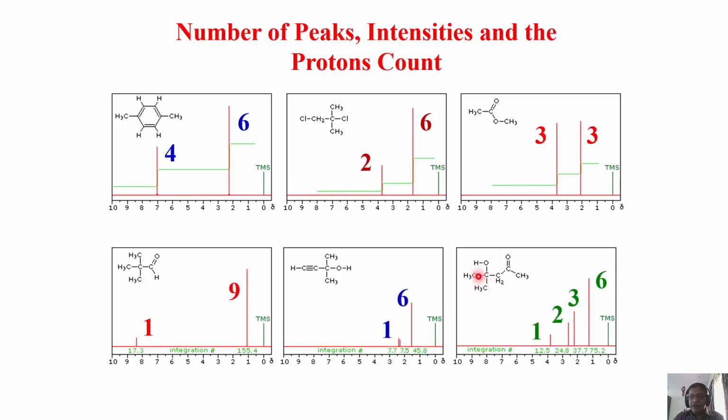Okay. In this molecule, it so happens this CH3, maybe the structure that is written is like that. These two CH3s are equivalent. Sorry, I did not know the structure. So there are 4 peaks here. OH is also here. OH is 1 peak. It is a theoretical stick plot. So this is OH. I mean, theoretically it is right. Although there is no symmetry, it is made to be equal. There are 2 CH3s overlapped here, intensity 6. Then 1 CH3 here, intensity 3. This is CH2, intensity 2. OH is intensity 1. This is how you can count the number of peaks and measure their areas. It will give you the proton count. You understood?